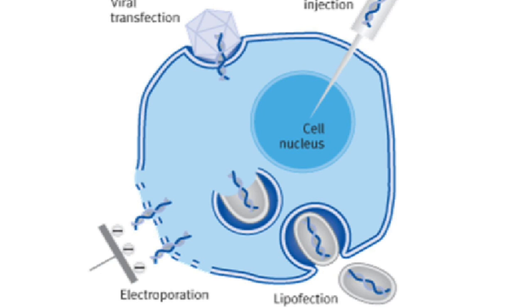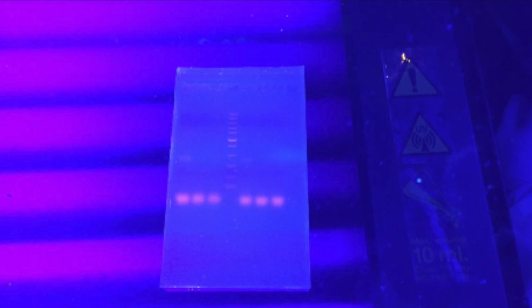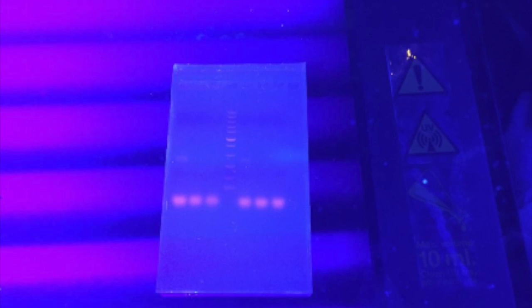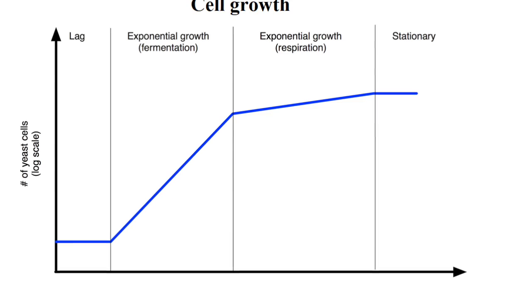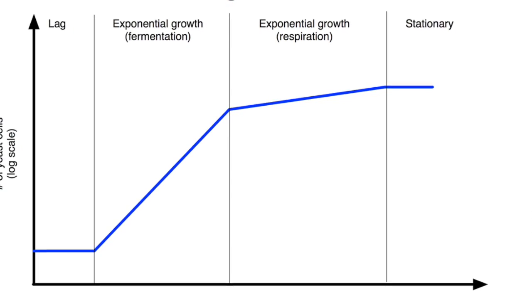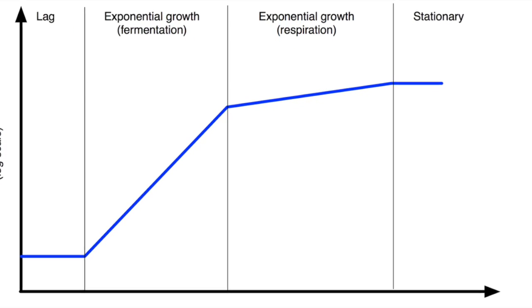Similarly, it is essential to have strong cells, so it is recommended that the cells be in exponential phase, planted just a few hours before initiating the pulse. Then, it is necessary to give the cells a recovery time in a nutrient-rich medium, such as SOC medium, and avoid subjecting them to broad temperature changes so that they can survive the process.